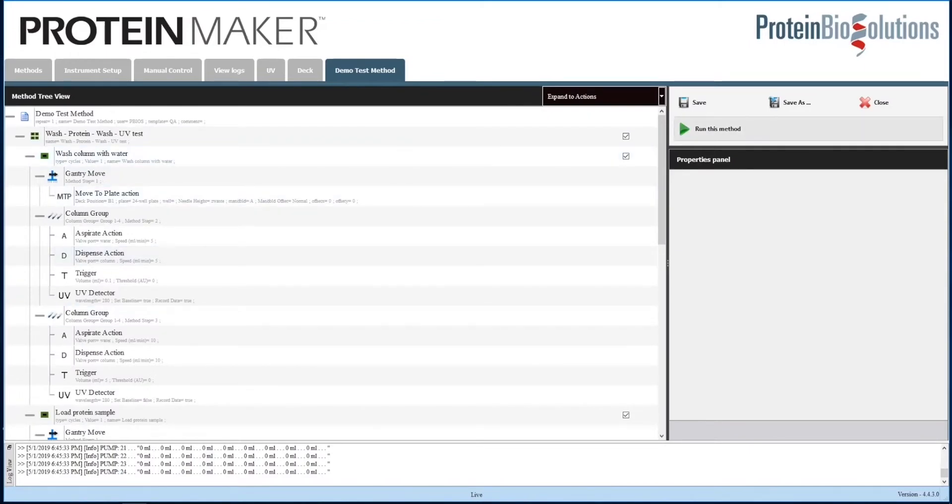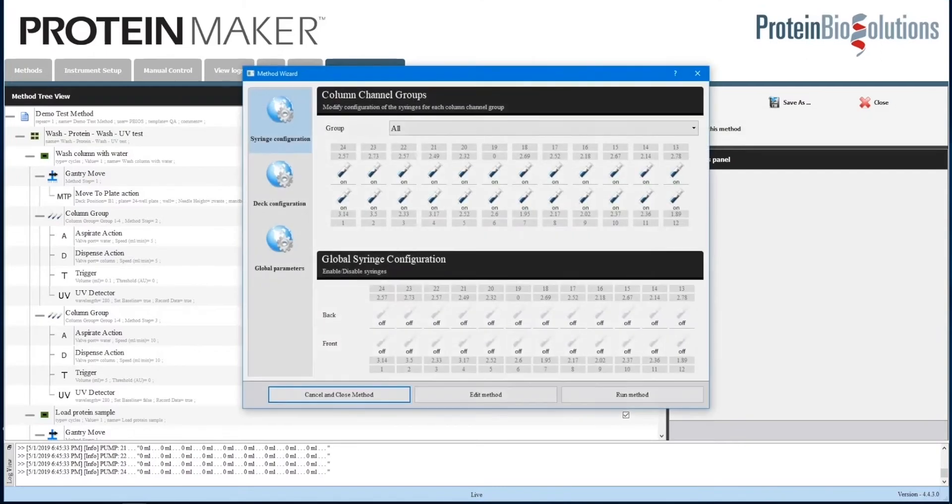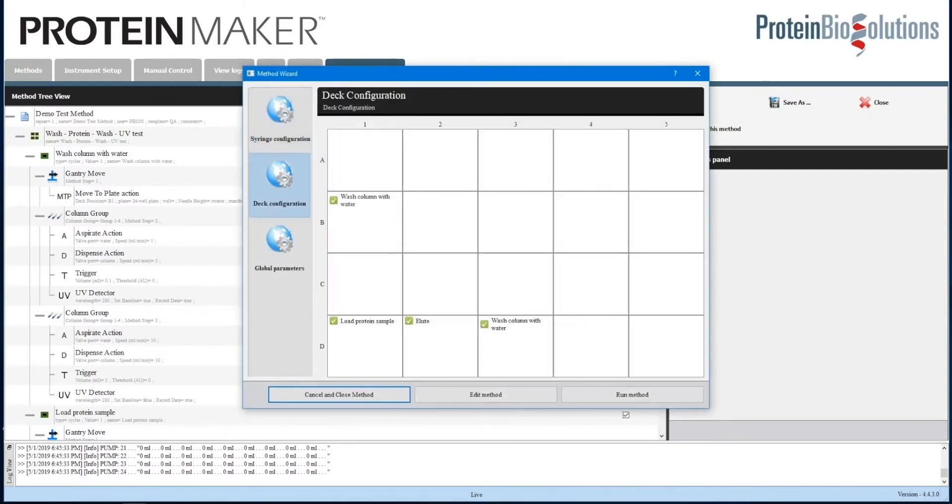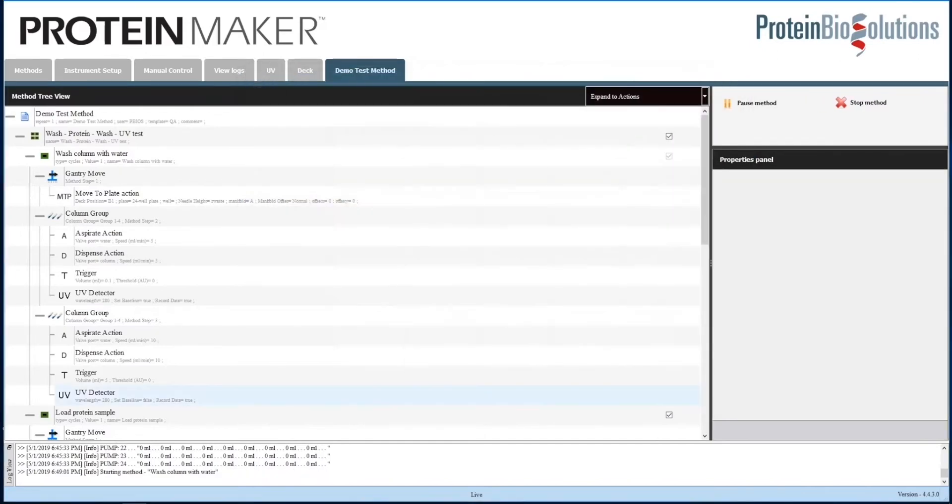When you click Run, the method wizard comes up. It's really helpful to look at the Deck Configuration tab, which shows you what will happen at each plate position, and reminds you which positions will be used.